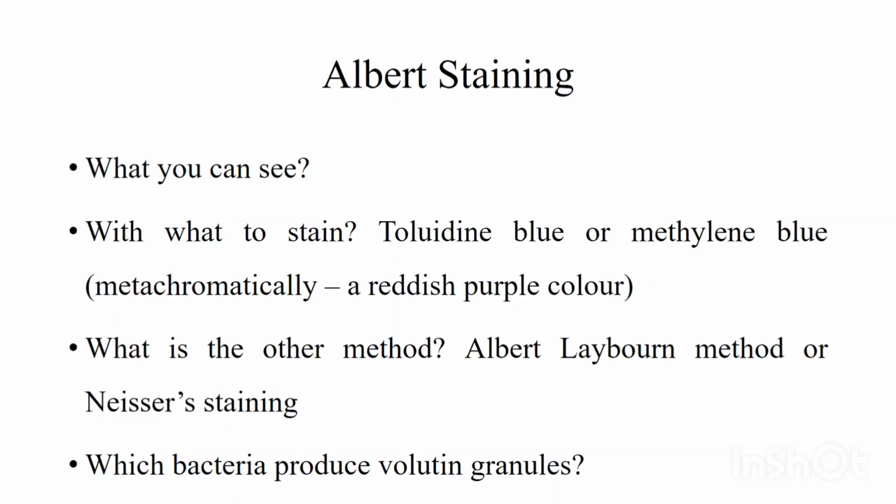Hello everyone, we'll see Albert staining today. What can you see with the Albert staining?